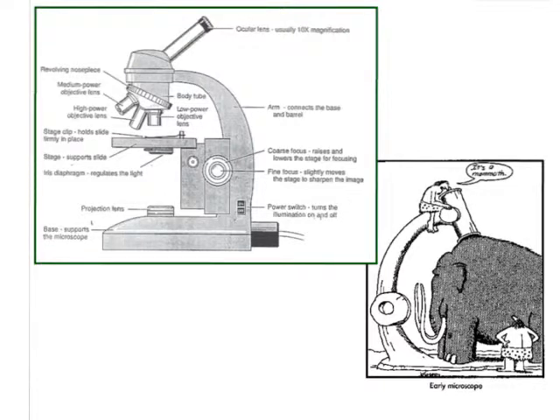So there you have it. There are all of the parts we're going to look at on our microscopes. One thing that's very important to remember, there's to be no horseplay when we do our practicum. We're going to learn how to use the microscopes, and they are expensive pieces of equipment, and we need to be certain to always treat them with respect. We carry them by the arm with one hand and keep a hand under the base so that it's always supported, and always be very careful.